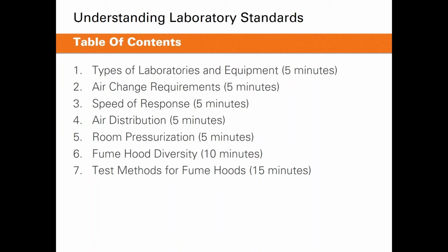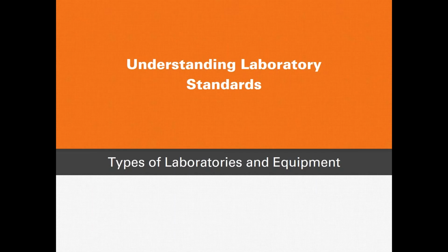We'll also talk about room pressurization in laboratories and how the standards call that out, as well as fume hood diversity and doing an example of how to lay out fume hood diversity and implement it. The last thing that we'll discuss today is test methods for fume hoods and the standards that go along with that.